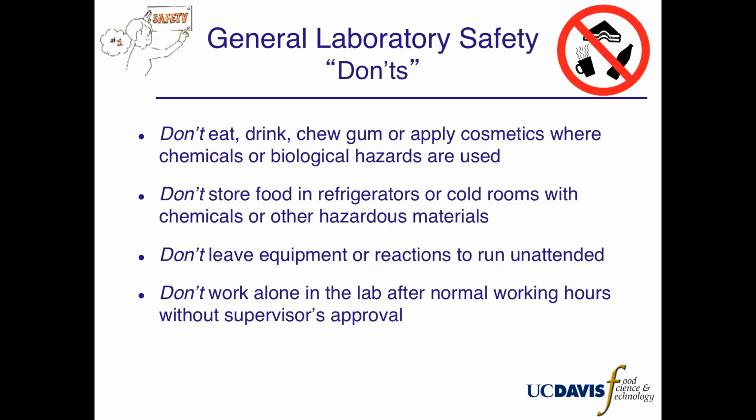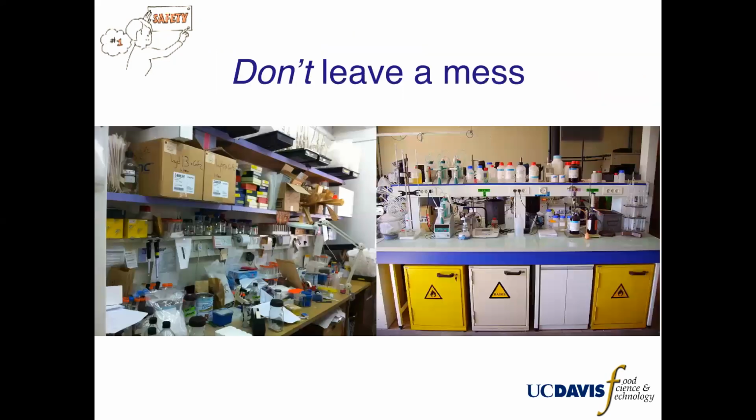If working alone is approved, make sure you are familiar with emergency procedures and emergency contacts. A notification system within each lab when a person who is working alone arrives and leaves the building is advised. Each lab is responsible for having a working alone SOP. Don't leave your lab a mess. Each lab should be clean, organized, and free of clutter. All chemicals and solutions should be properly labeled and stored. A clean and organized lab helps to prevent accidents.